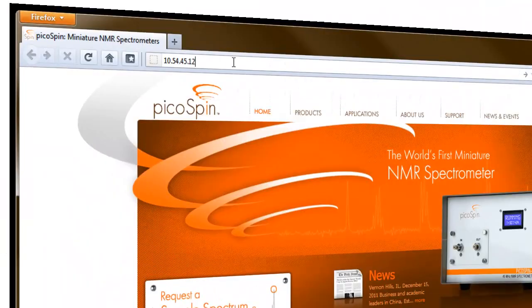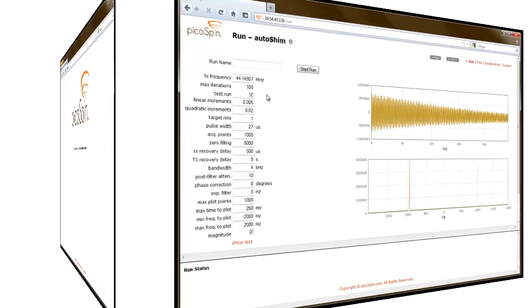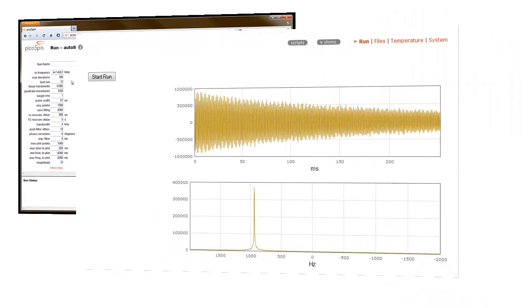Let's start by navigating to the Run page and making sure we're in the AutoShim script. If you're not already on the Run page, simply select Run in the upper right-hand corner of the user interface. This will refresh the screen and take you to the last script that you were using.